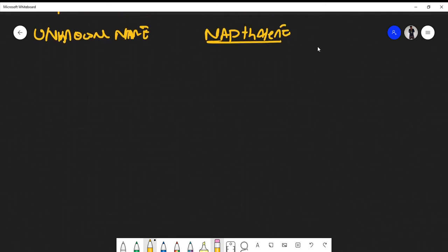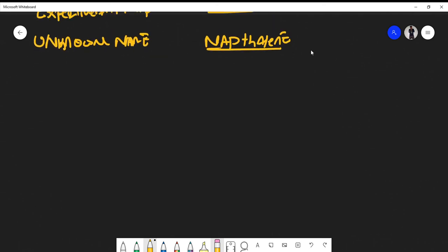Now, the last data table is a mixture, which is what you actually want to do to confirm for sure that you have what you say you have. So it's pretty much to confirm that you have what you say you have.